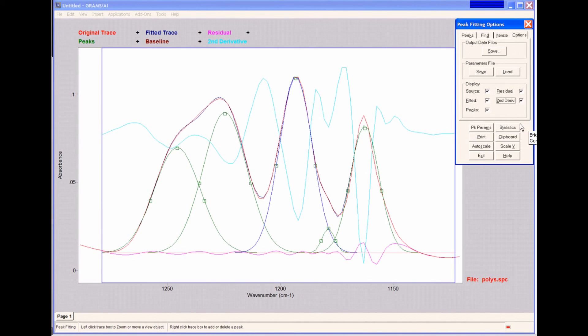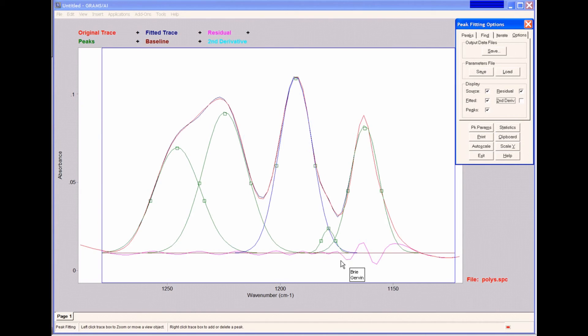Now, if I look at the residual here, it tells us that perhaps I may have missed something. There may be another peak hidden in here somewhere.